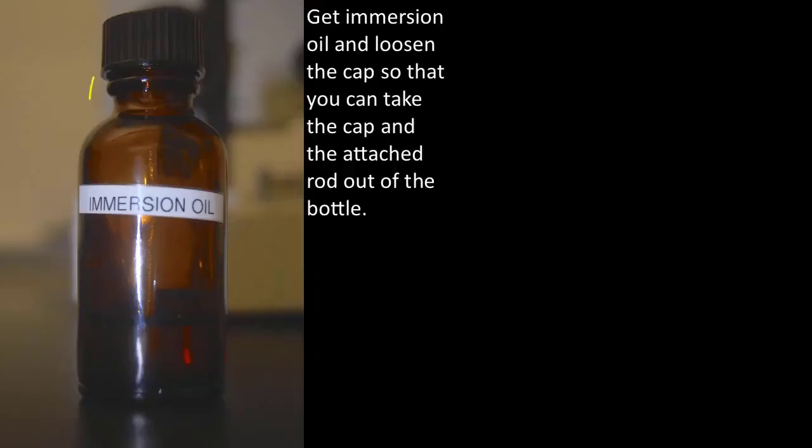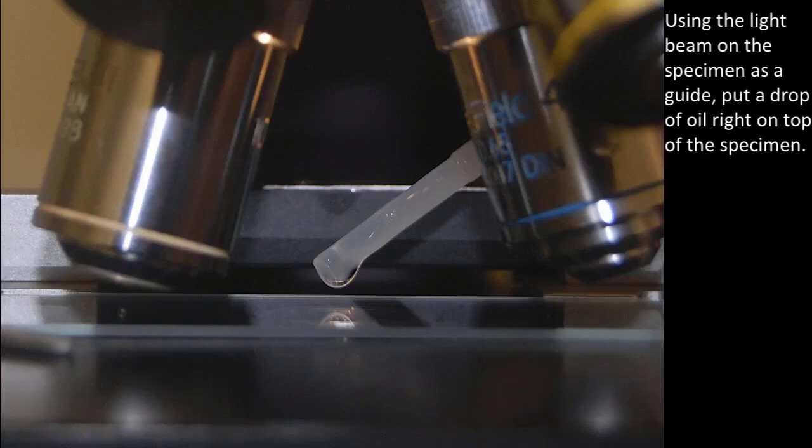Get immersion oil and loosen the cap so that you can take the cap and the attached rod out of the bottle. Using the light beam on the specimen as a guide, put a drop of oil right on top of the specimen.